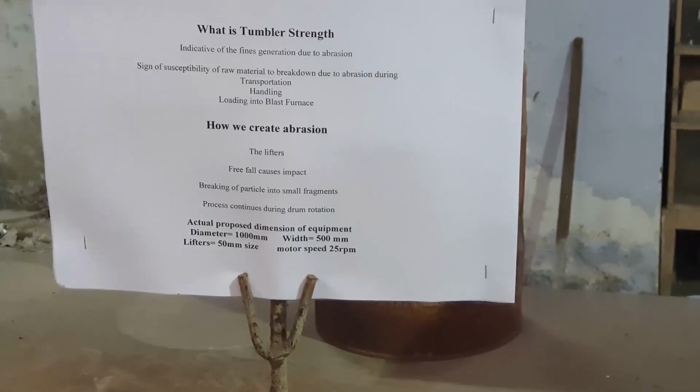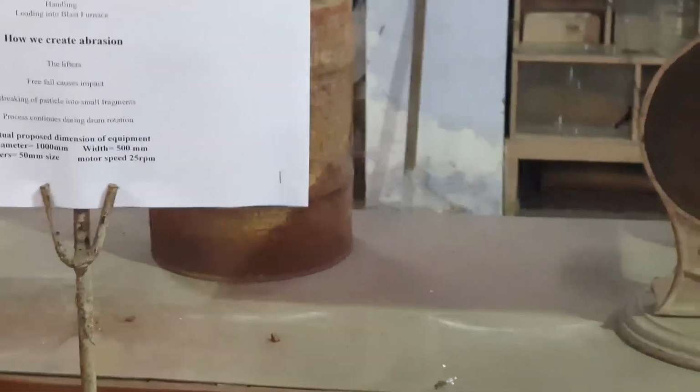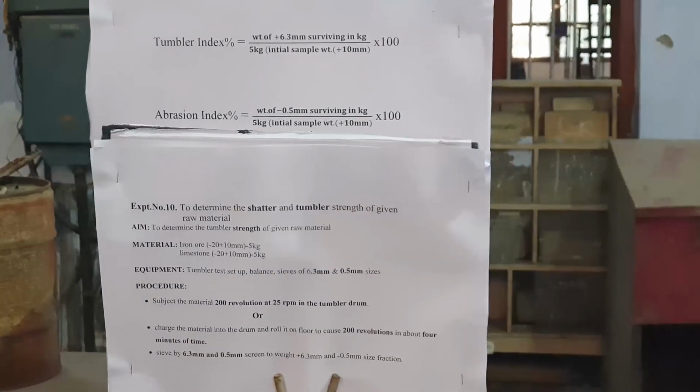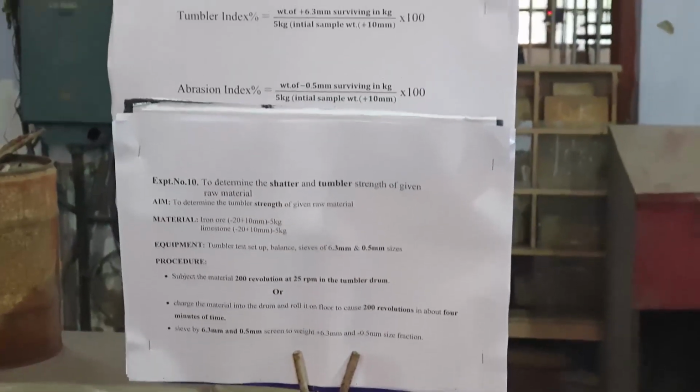And inside there will be lifters, because here we are checking the tumbler index. Tumbler index is also like the shatter index. It is the susceptibility of the raw material to break down into pieces because of impact force. While calculating the shatter index, the material has fallen from a certain height, 2 meter height.